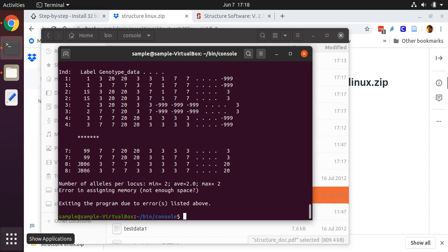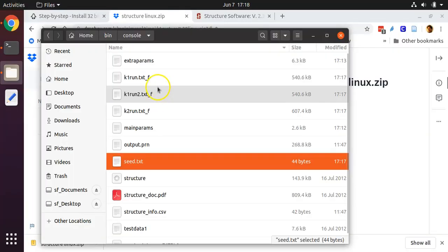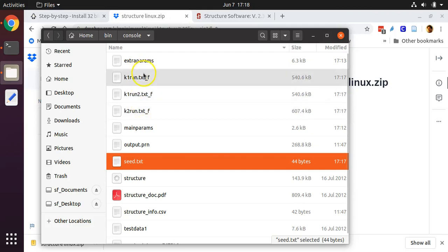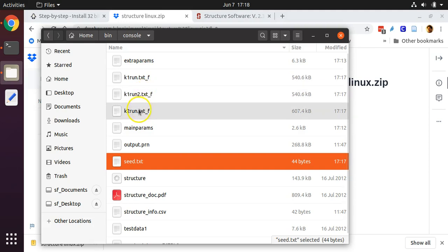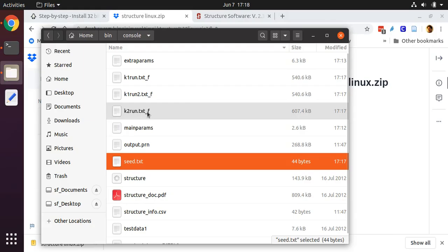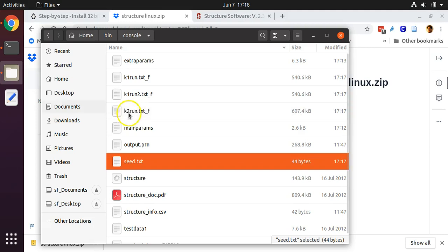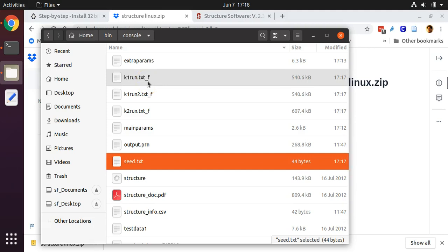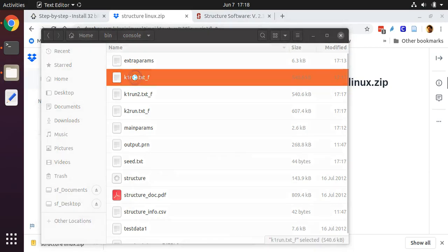I should have assigned this virtual machine more memory. It ran out of space, but it did do the first three runs. So we have both replicates for this scenario of one inferred ancestral group, and we have one replicate for the run inferring two ancestral groups. Although, if I would have had any reasonable amount of memory allocated to this virtual machine, it would have run the second replicate as well. But that's a minor issue. I'd recommend assigning at least four gigs of memory to your virtual machine if you can. I did not. I have one gig of memory assigned.